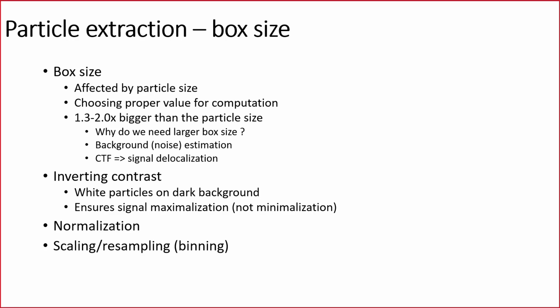Also, we need to take care of inverting contrast. So far, we worked with micrographs that had dark particles on a bright background. Now we need to invert this contrast to white particles on a dark background.